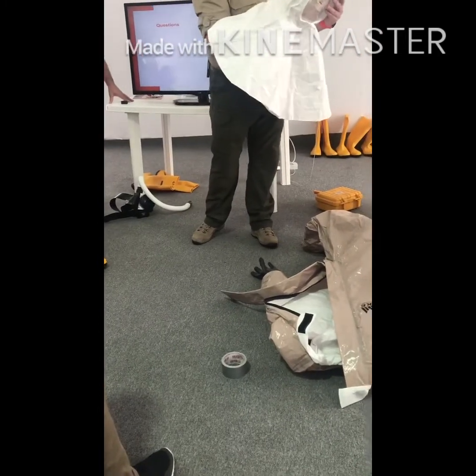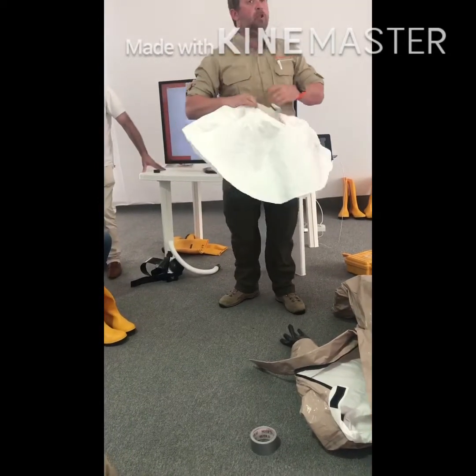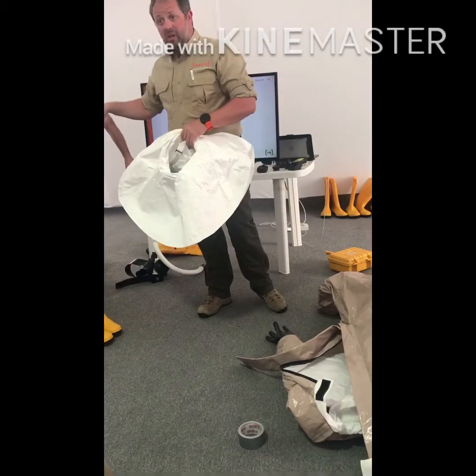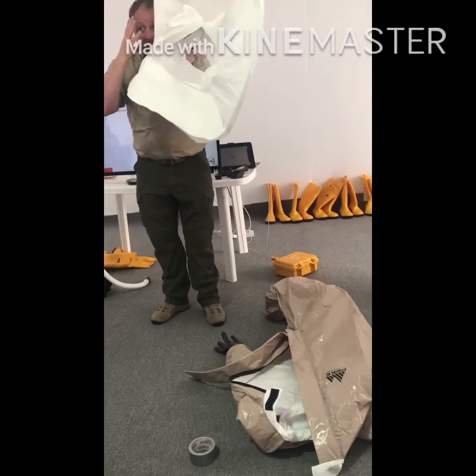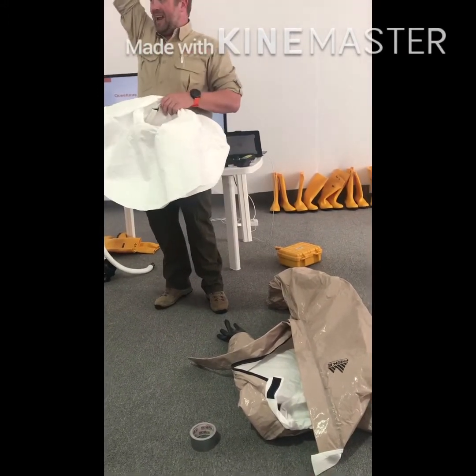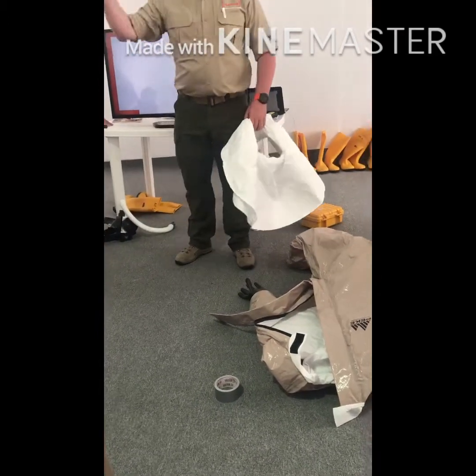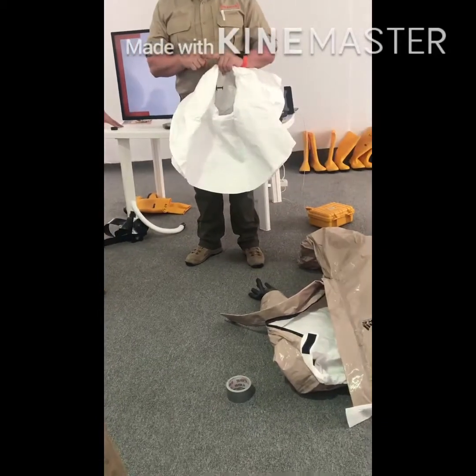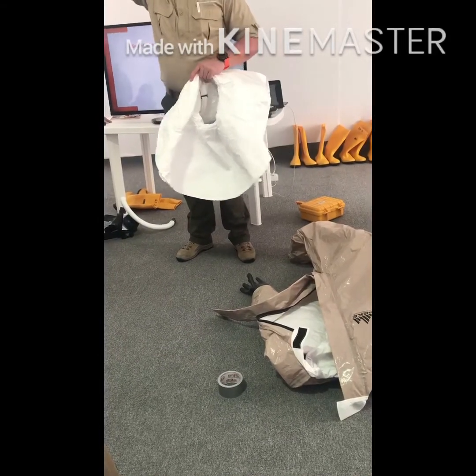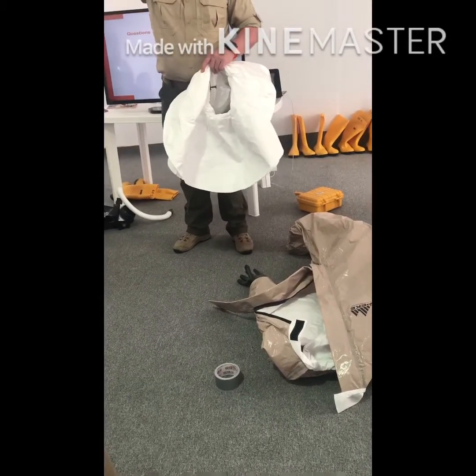The important thing with the PAPR hood is inside there's a head restraint. I need to put this on my head and tighten that before I start attaching anything. Because what you'll see is when we do it in a moment, it pumps air into it, so it inflates it. If I don't have that on my head tight, my hood's going to inflate off my head. So we've got to make sure that happens. If we have long hair, in the front pocket of your bags is a little plastic seal bag. Inside there's hair nets. So get the hairnet on, otherwise your hair's going to get in your face and everywhere, and it becomes quite annoying. As you can see, I don't have that problem.